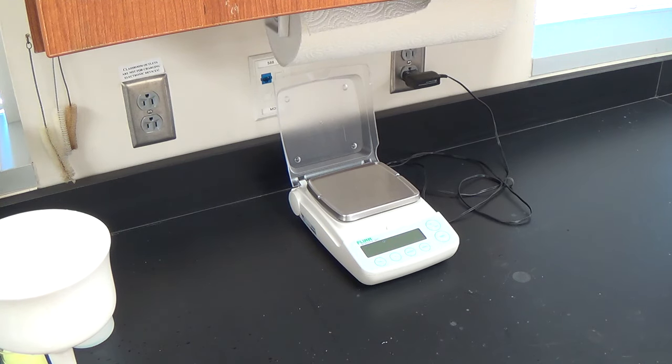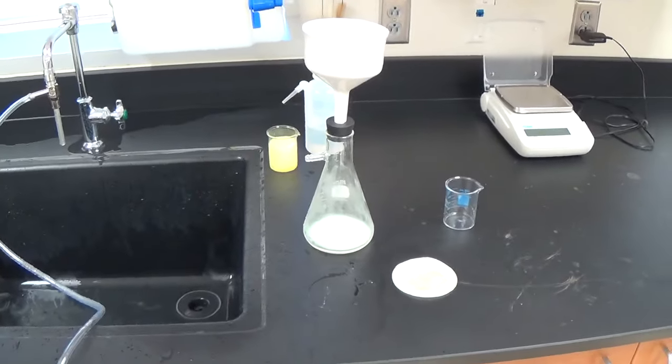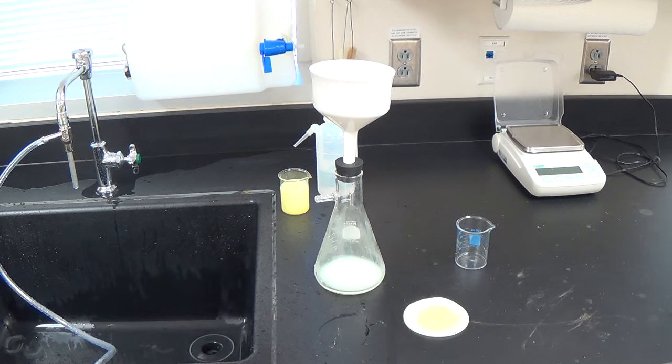All right, so that's our water hardness lab. I wanted especially to introduce you to the new equipment. That is the vacuum filtration. Okay, going to speed things up for us. Too bad we don't have the drying ovens to really speed it up for us, but that's all right. Better that we take 5 minutes slowly pouring it through this than to take 20 minutes letting it go drip, drip, drip the old-fashioned way. All right, so good luck. This is what's expected of you tomorrow.